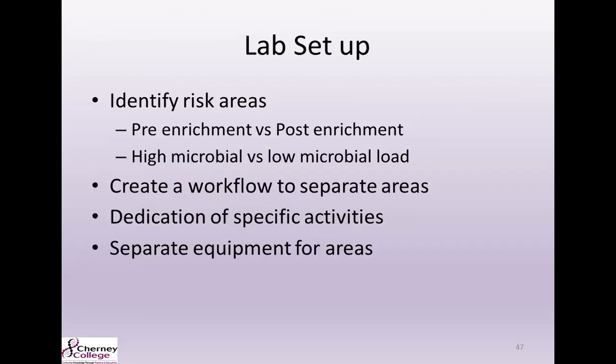In your lab, you're going to want to identify any risk areas. Obviously, pre-enrichment is going to have a low microbial load risk versus post-enrichment, when that bacteria is at its happiest. You're going to have a high microbial load. So make sure that you're setting up your internal environmental monitoring program based on your risk areas.